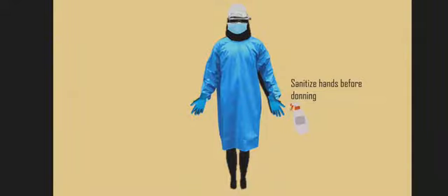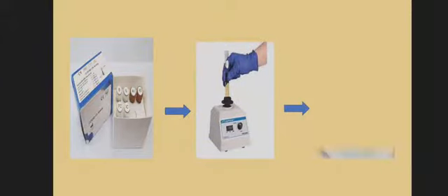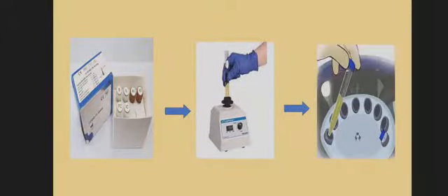Once the PPE is worn, we may now proceed to the reagent preparation room. The reagents are stored at refrigerator temperature, but the enzymes are kept frozen; if the enzymes are found thawed, reject them. After getting the reagents, load them into the vortex mixer to resuspend the small vials of reagent. Remember not to vortex too much because the reagents might get damaged. Next is to load the reagents to the centrifuge, ensure that it is balanced, and centrifuge for about 10 seconds. After centrifuge, we may now proceed to the using of reagents.